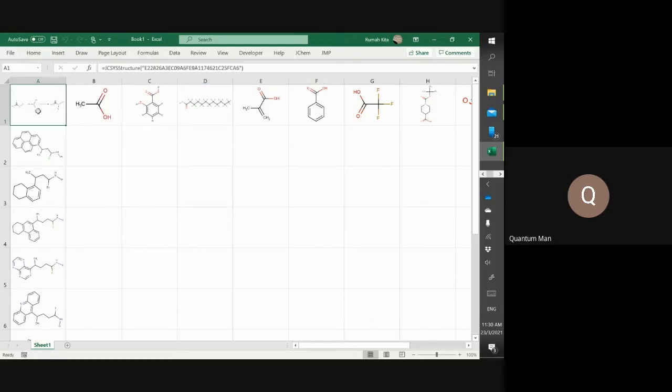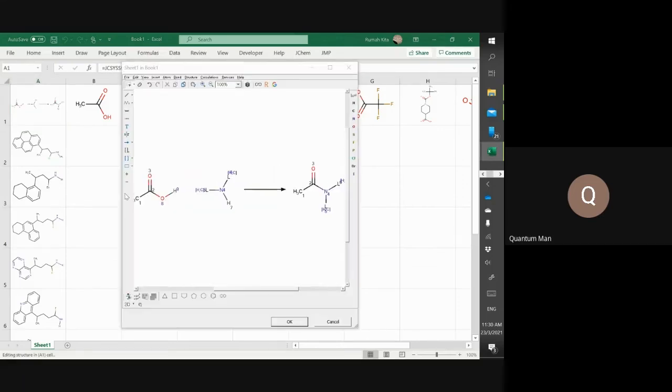Okay, so that is the defined reaction. Just to remind you, you can actually write your own reaction if you want to. You write your own reaction, and then you map the atoms. For example, when amine and carboxylic acids react, you get an amide plus H2O. You don't have to draw the H2O, but you can still draw it. If you draw the H2O, then you have to define the atoms and map them.